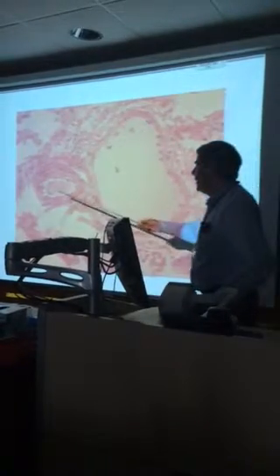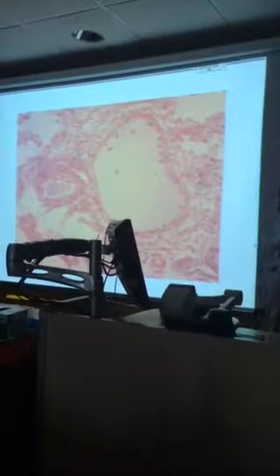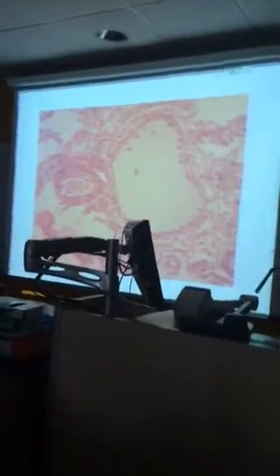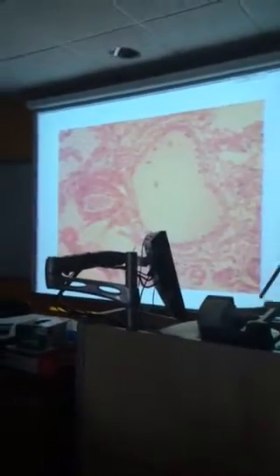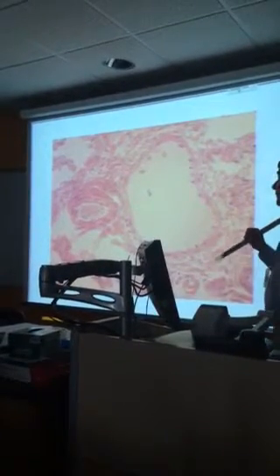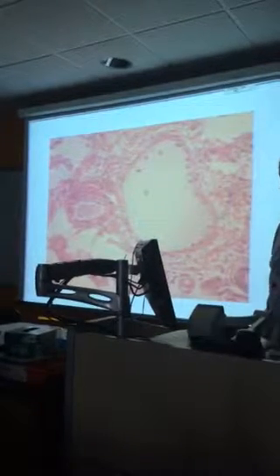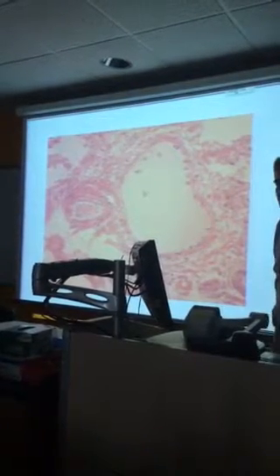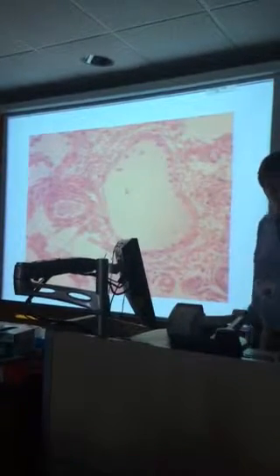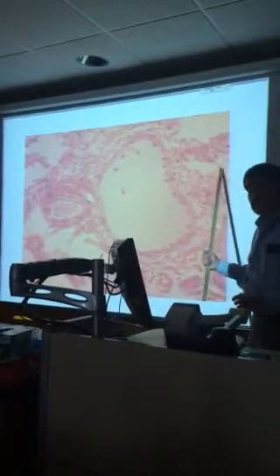This one and this one. One is a vein, one's an artery. Actually, a small vein, a small artery. What's this? It's a small vein. It's called a venule. And it's a tiny branch from the hepatic portal vein. So it's bringing in blood to those capillaries of the liver, but it's not oxygen-rich blood. It is nutrient-rich blood. Remember, the hepatic portal vein is doing what? It is draining capillaries in the GI tract rich in nutrients absorbed from your food that you've broken down, and supplying capillaries in the liver.